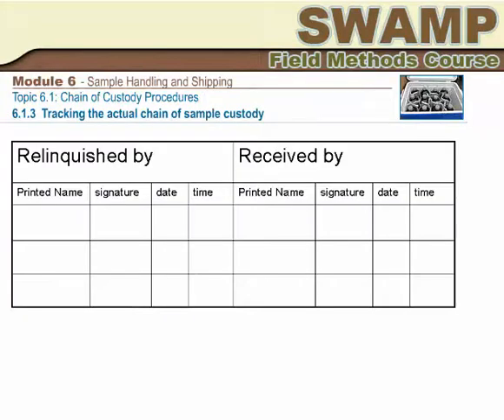Beyond the information that needs to accompany the samples regarding collection and requested analyses, the chain of custody form has a very important legal function that should not be overlooked. It is a document that assigns responsibility to all parties that have handled the samples and tracks the progress of sample transfer over time. Parts of this documentation may be done via the shipping label.